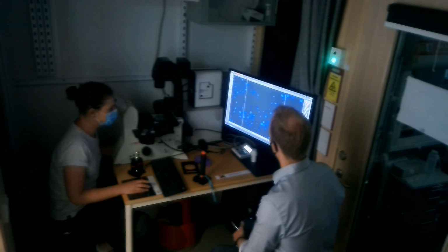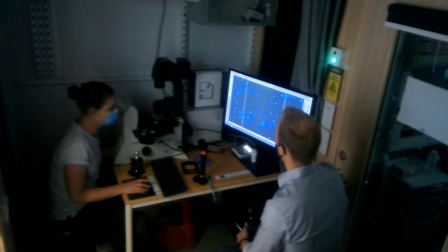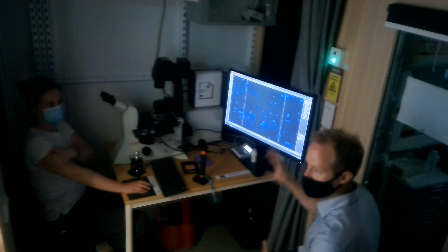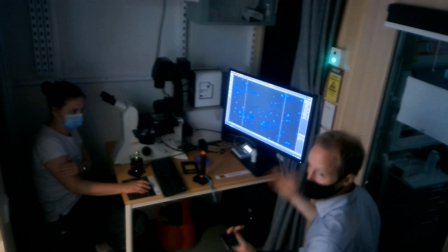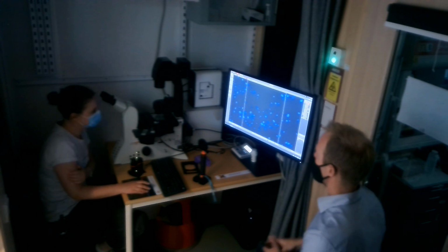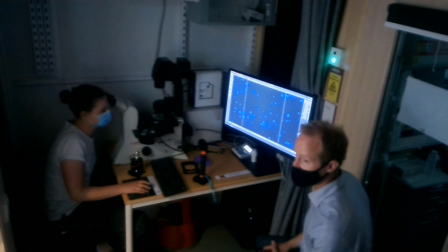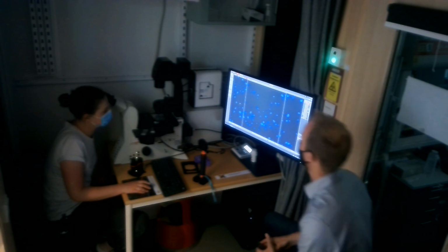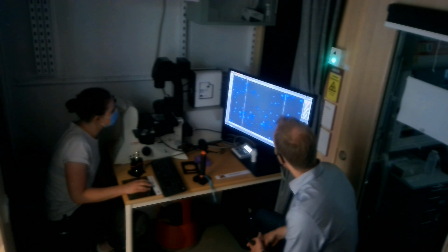So in Navigator, in this view, we don't have this over/underexposure button yet. Maybe in the future, who knows. This is one of the parts of the software where we typically see new features with every release since it was released, so maybe at some point.